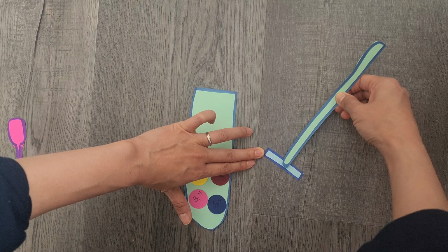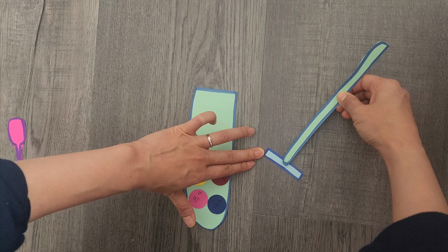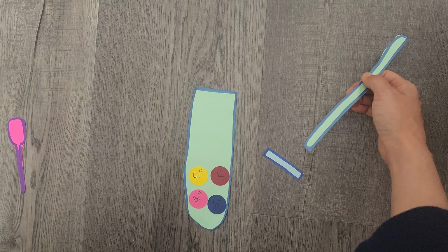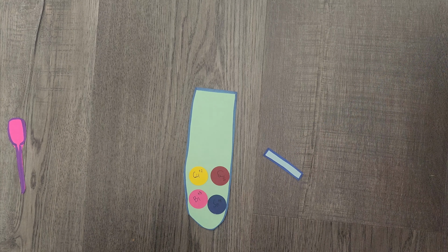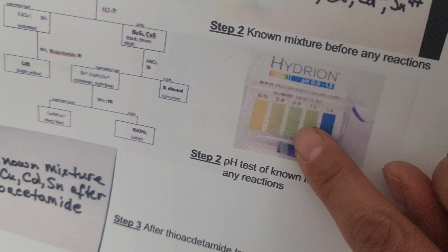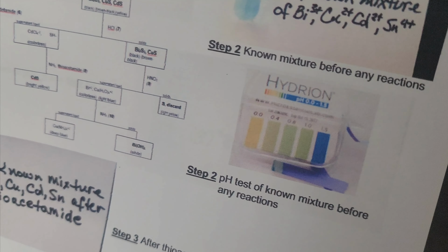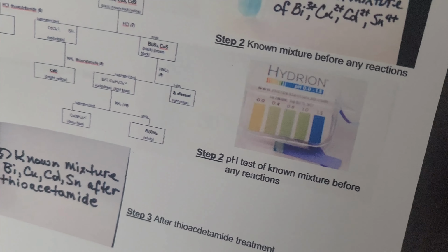This is a short range pH paper. You want this to be somewhere around 0.5 or 0.3, and it's bluish greenish in color. So I have that image over here. This is the pH paper we're working with, and you want that to be somewhere around here, 0.4 or 0.8, around that area. You can see that right here.